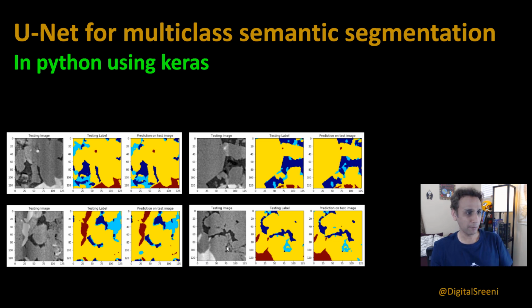And I'm not sure if it's clear from the video, but if you look at this busy clustery area, this darkish area, this is actually another mineral. This is a clay mineral in this image. In fact, this data set is a 3D volume.